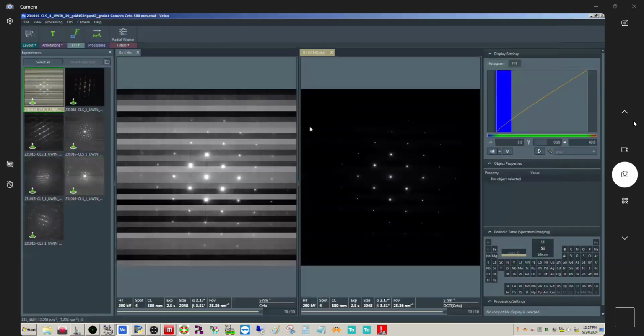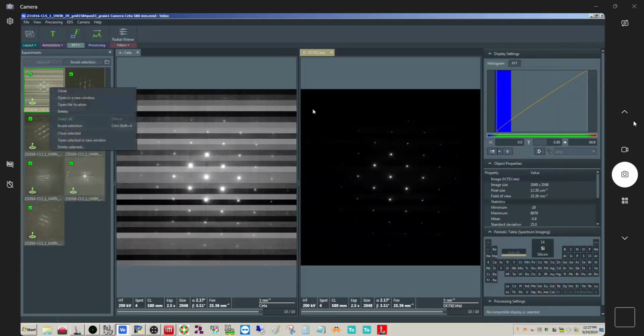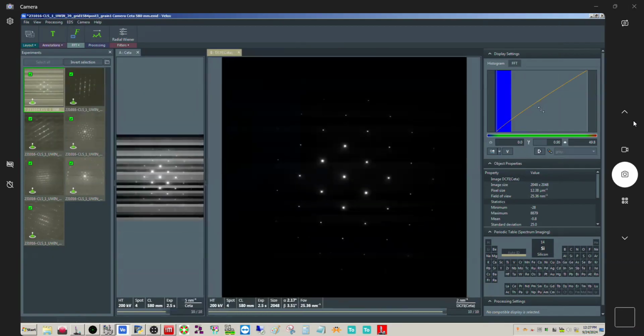Yeah, with these, this is what I was afraid of. Anyway, I'll use these here, okay? So you can see right here's your histogram. Your histogram is telling you that most of your pixels are between 0 and 50 counts. If you look at the actual properties, the situation is a lot different. In this case, I actually clipped the max range a little bit. This is what you want to avoid, but it's not showing up in the histogram.